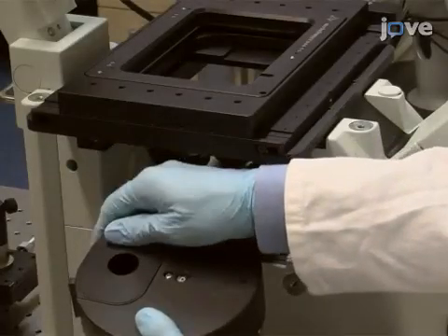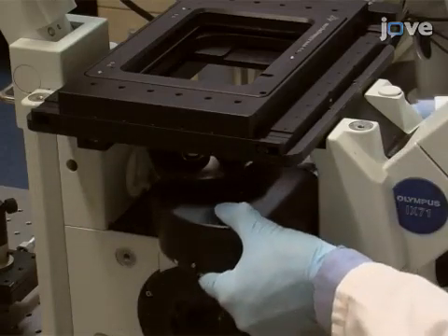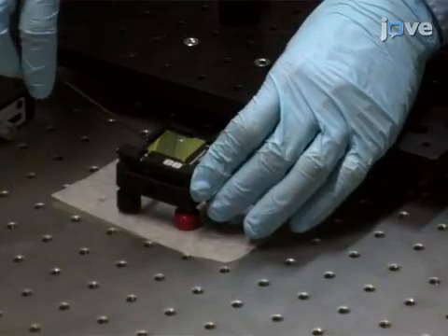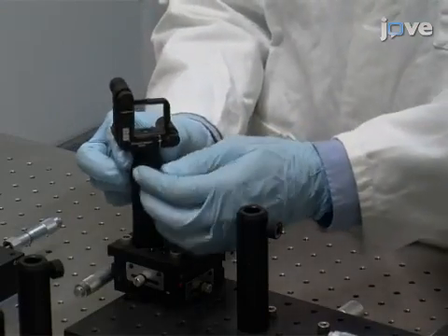After inserting the first dichroic mirror DM4 into the filter cube turret of the microscope frame, insert the second dichroic mirror DM3 into a 1-inch square kinematic mirror mount and position it one focal length away from the condenser lens L5.